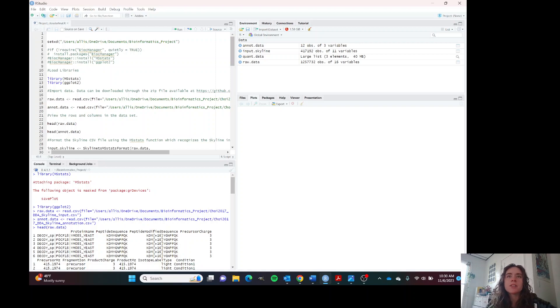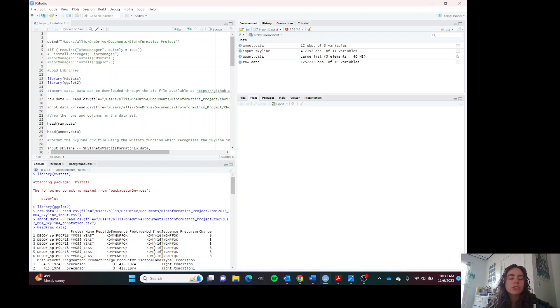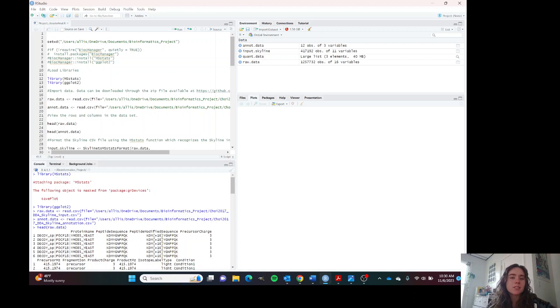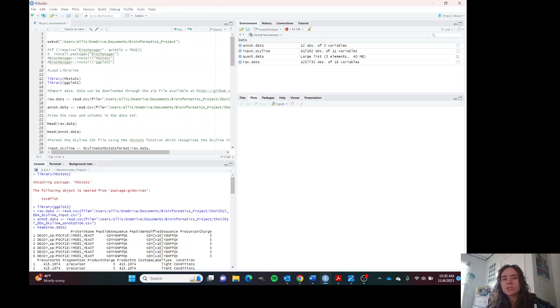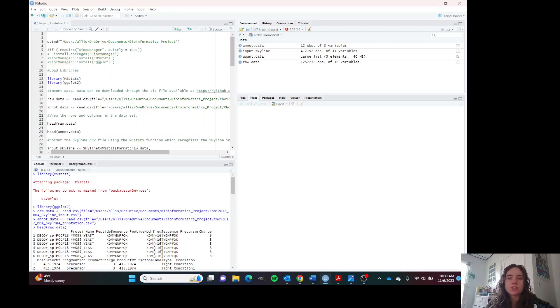This manual will demonstrate how to use the MSStats package to format and process your mass spec data and then how to visualize it using ggplot and also using the process data plots, which is part of the MSStats package.